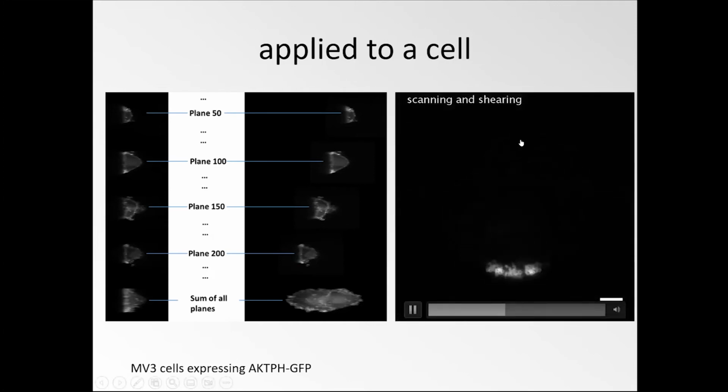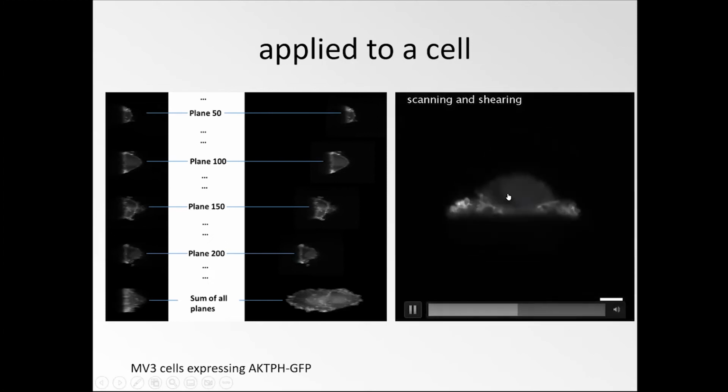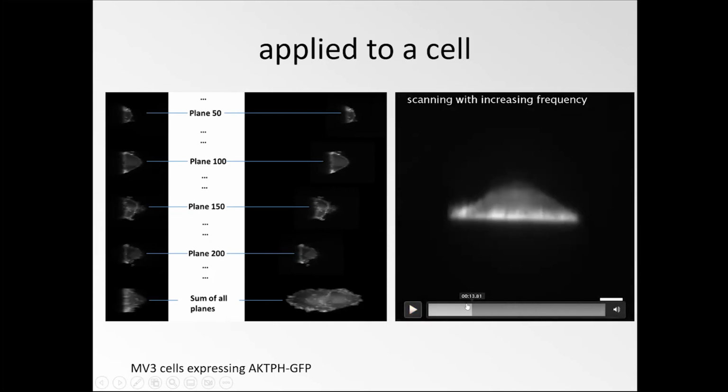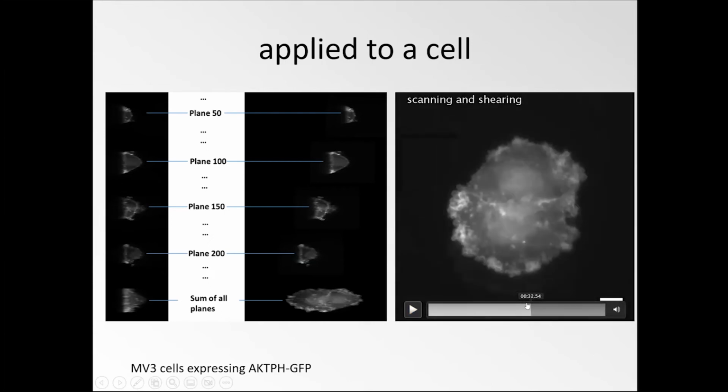So here, we again sweep the focal plane, but we also add, with the same signal generator, a lateral shift on these galvos that create the lateral shift. And once we reach the frequency of the camera, we get an analog projection that is obviously different from this one here, which is more from the side, and this one here is more at an angle.